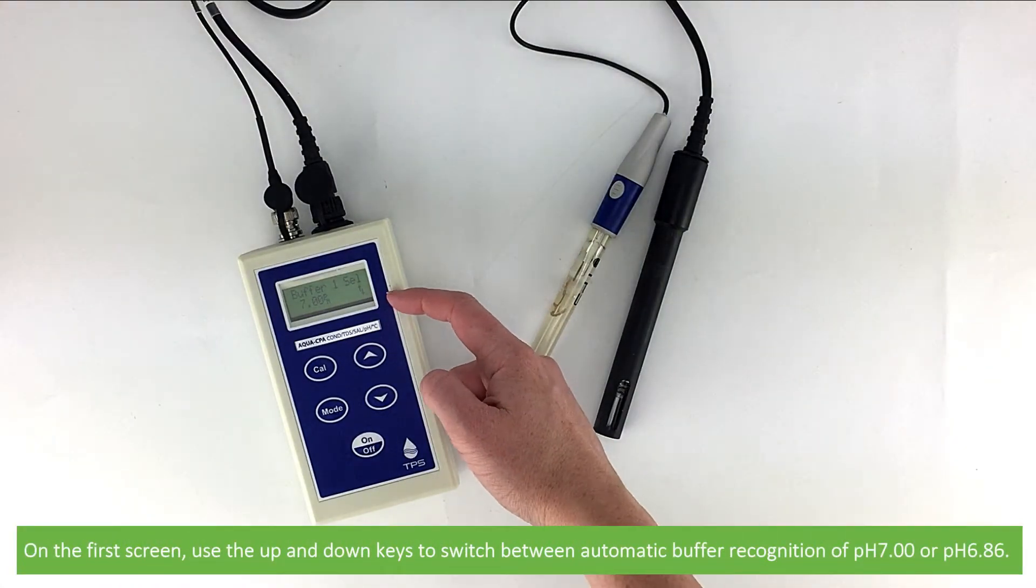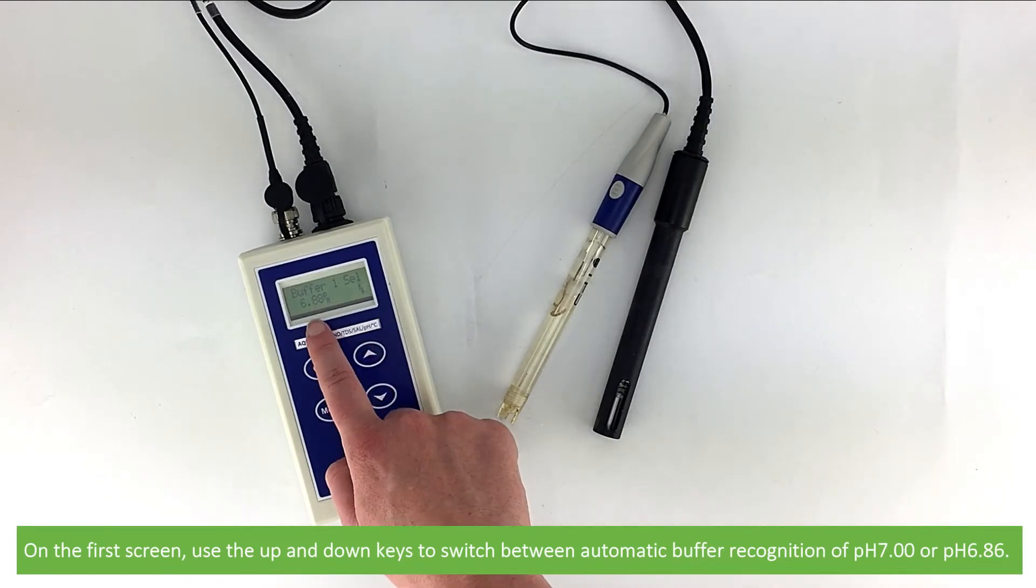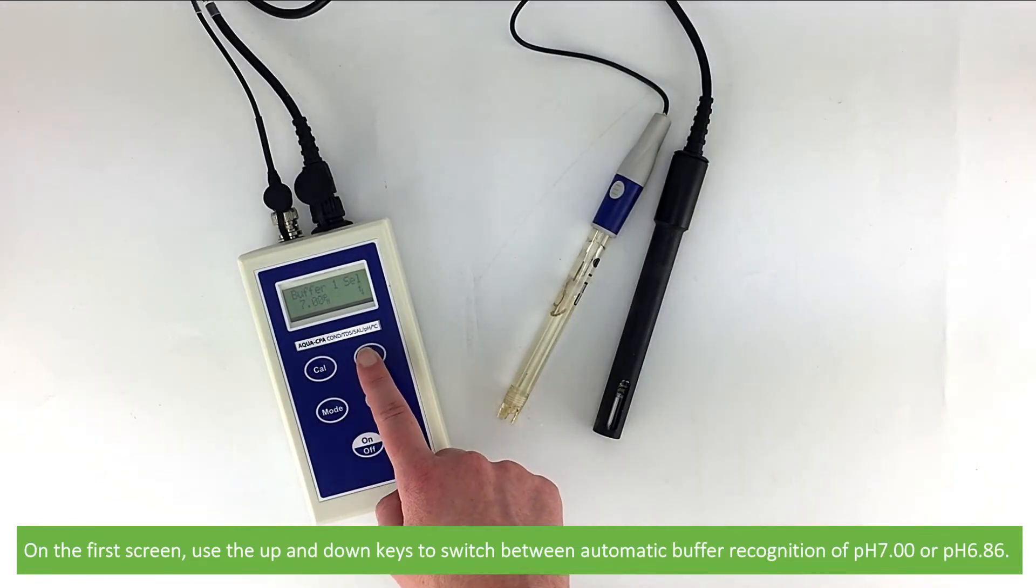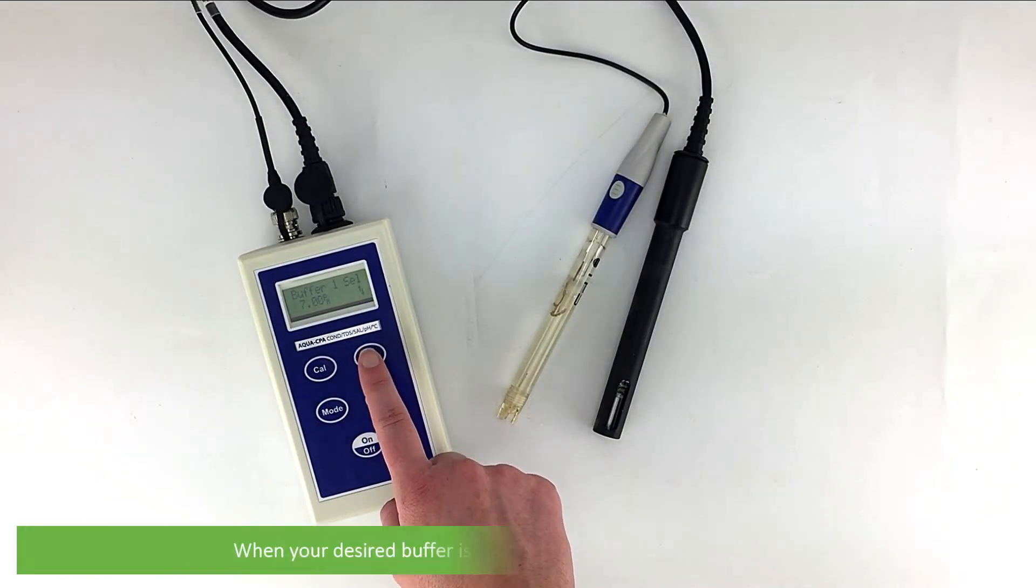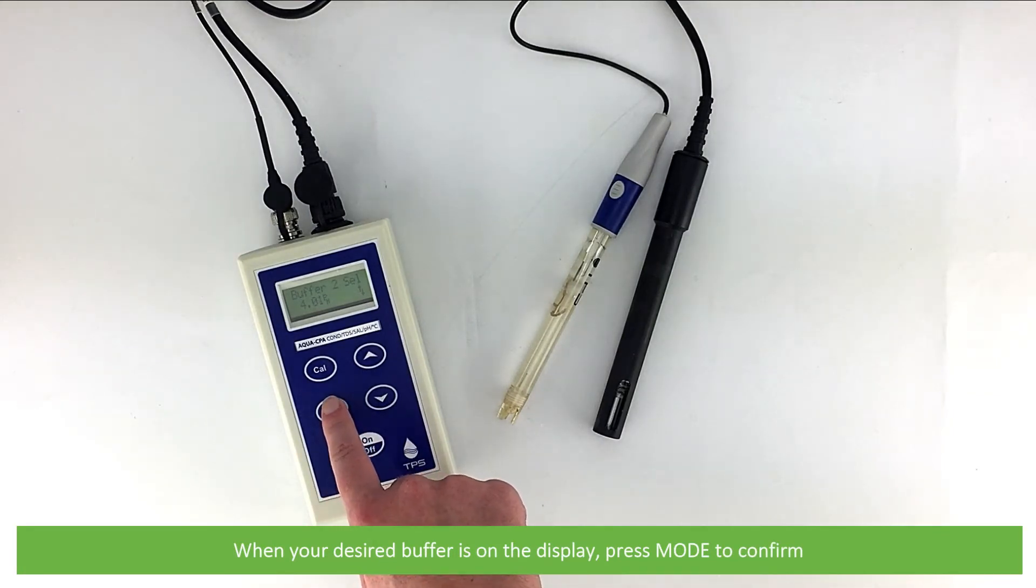On the first screen, use the up and down keys to switch between automatic buffer recognition of pH 7 or pH 6.86. When your desired buffer is on the display, press mode to confirm.